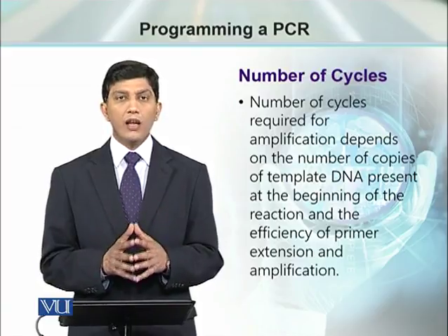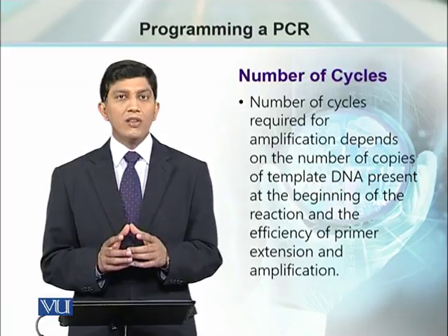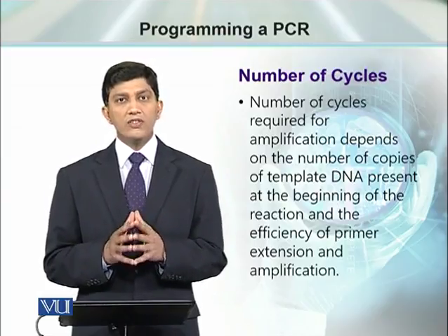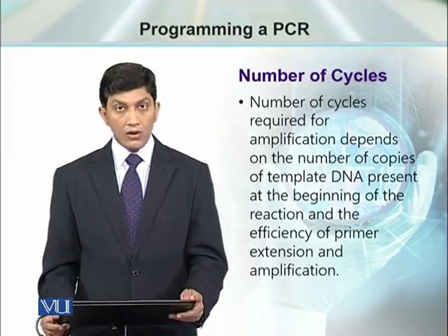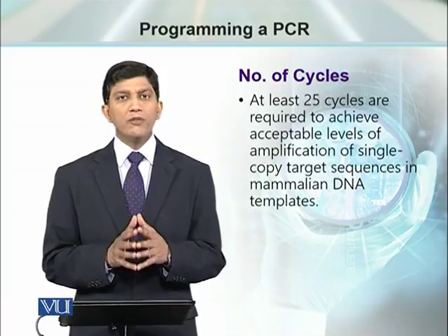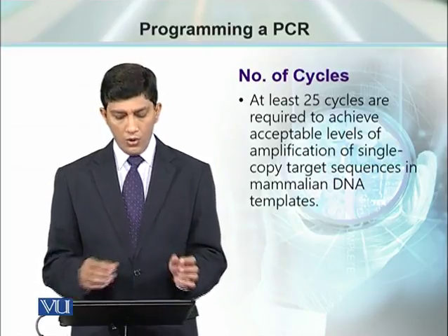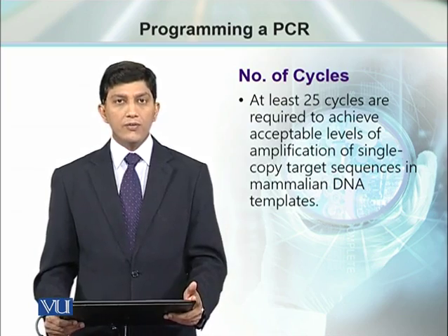How many cycles should we plan at the beginning of the PCR? It depends on the quantity or number of DNA molecules in the sample. That helps you to decide whether you should go for 30 cycles, 20 cycles, 25 cycles or more. As a general rule, with a single copy DNA, a minimum of 25 cycles of polymerase chain reaction is required to get some noticeable or acceptable level of amplification.